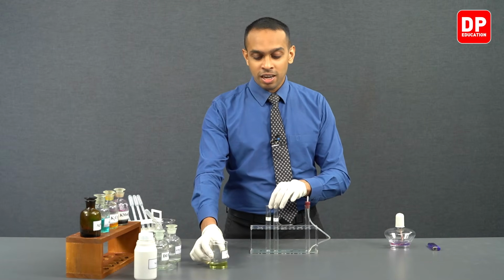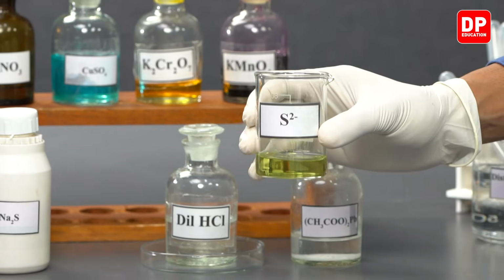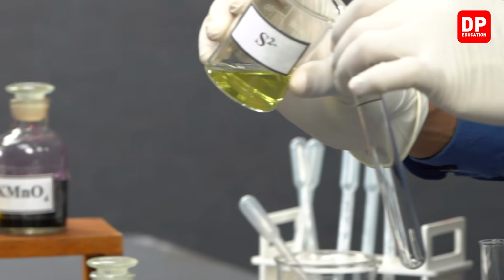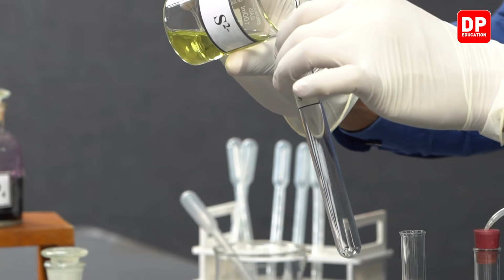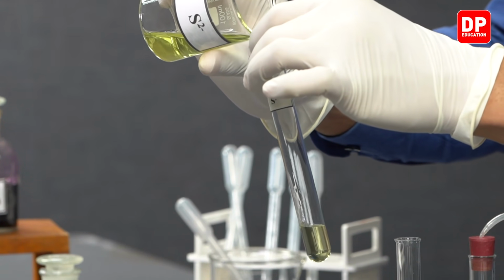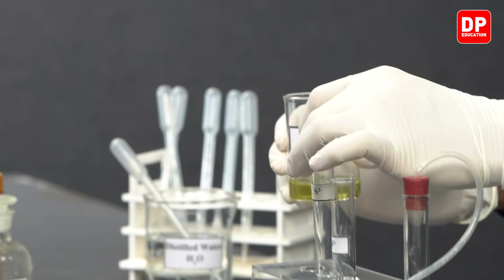So we have here our sulfide ion solution. Let's take a small sample of the sulfide ion solution into 2 test tubes.